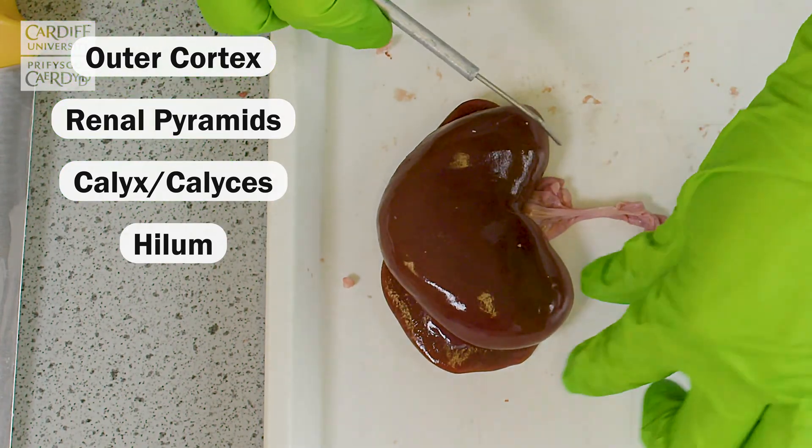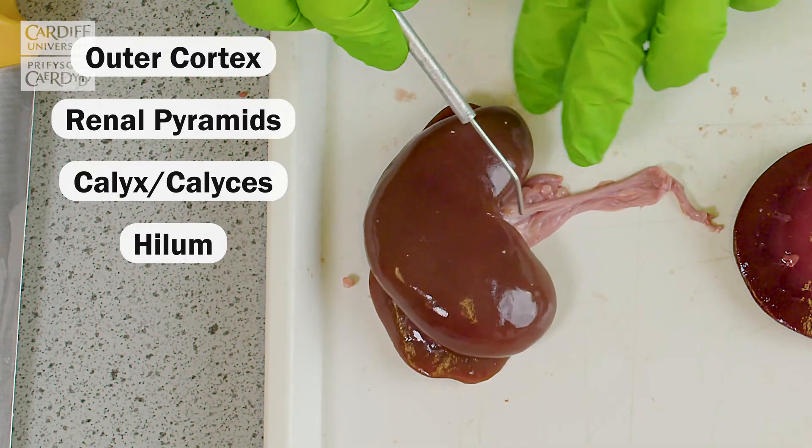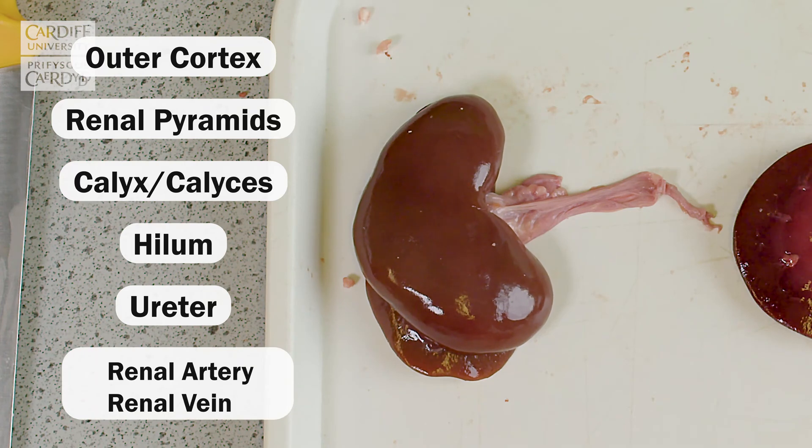And on the outer aspect, you'll see in this region here, this is the region that contains the ureter as well as the renal artery and renal vein.